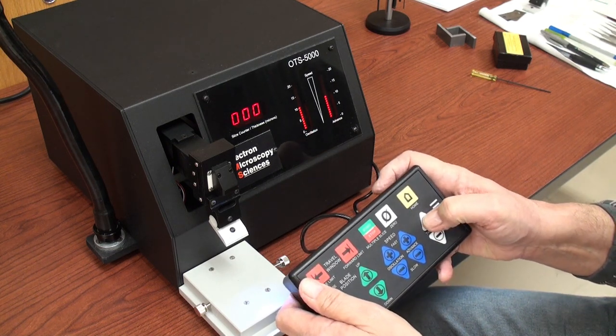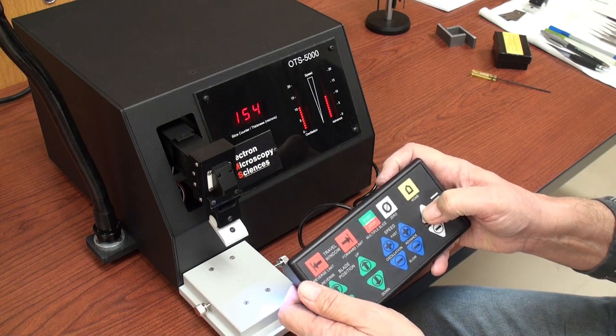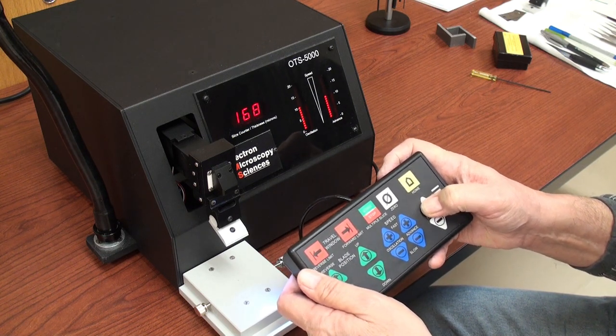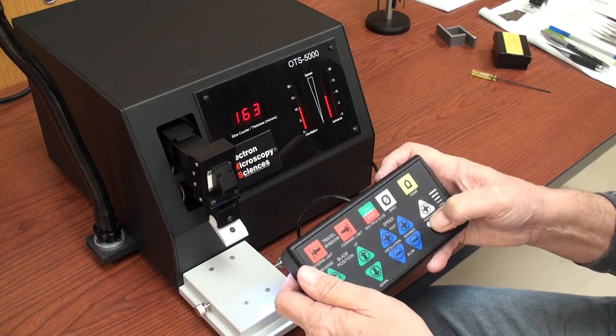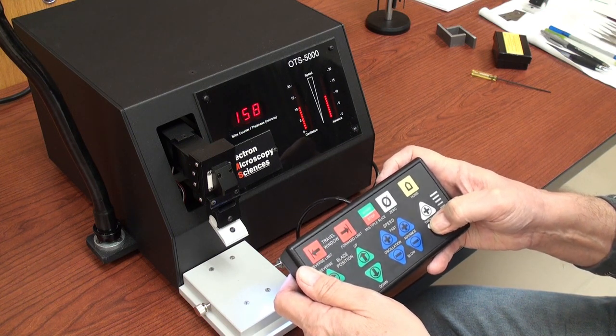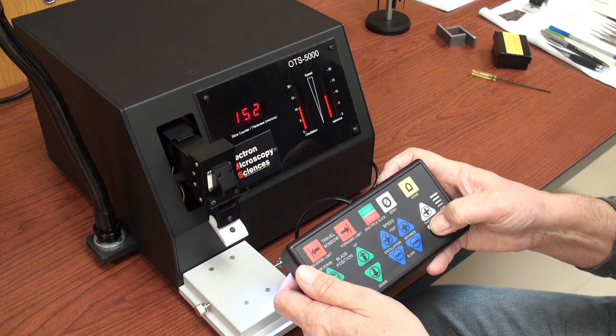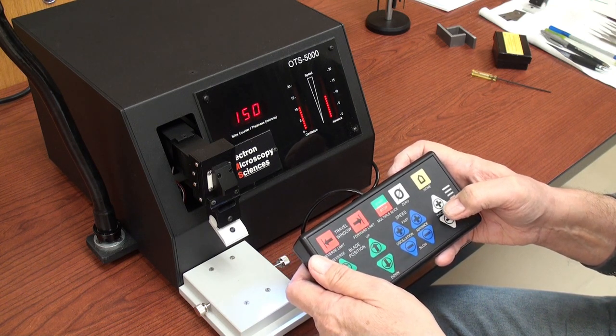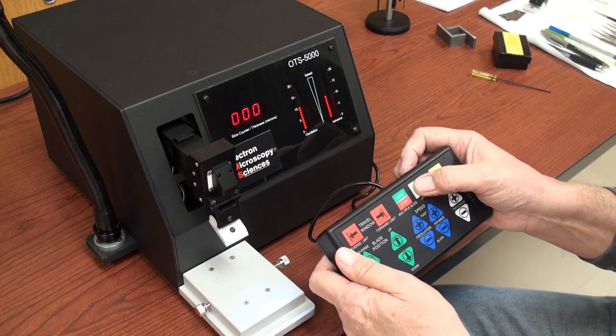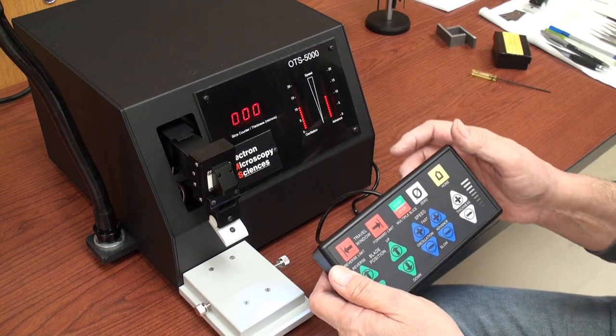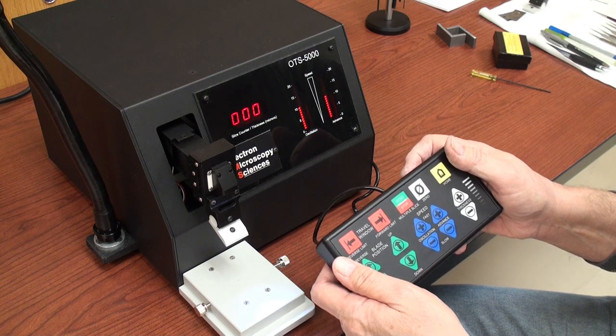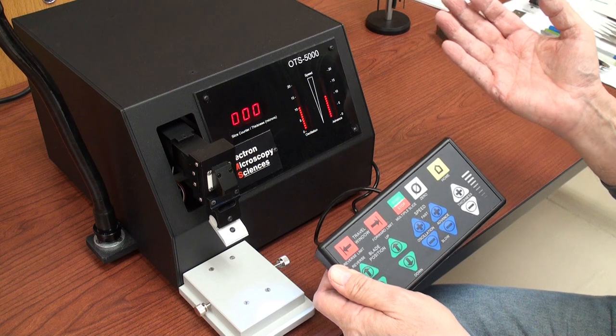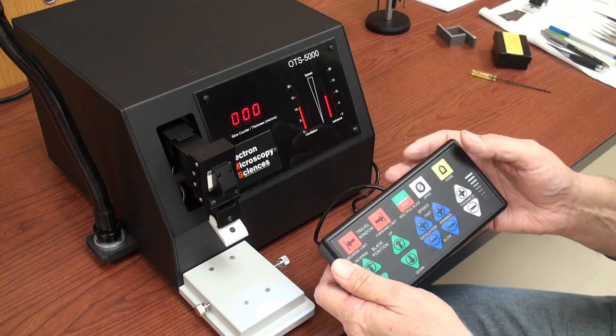This adjusts your thickness. Currently incrementing up to somewhere in the middle 160 micron range. Let's just leave it at 150. Zero zeroes out the section counter. So it tells you how many sections you've taken at 150 microns.